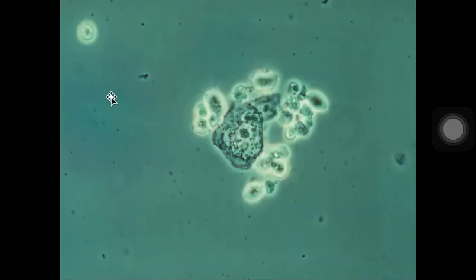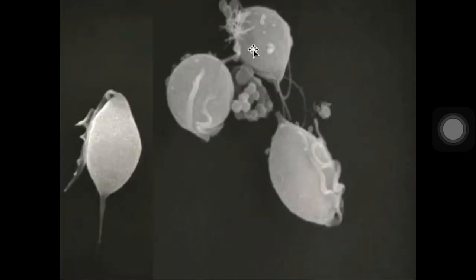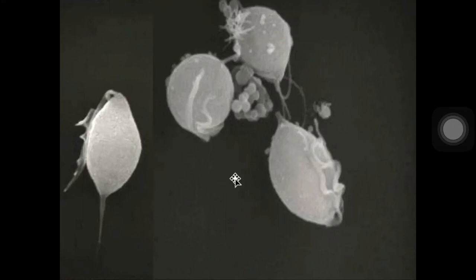And then this one is a phase contrast micrograph of a vaginal discharge, revealing the presence of Trichomonas vaginalis protozoans surrounding, this is an epithelial cell. Around the epithelial cell are the Trichomonas vaginalis. As you can see, they have flagella present there. And as you can see here more clearly, the undulating membrane and the flagella present. Next, using scanning electron microscopy, this is the presentation of strawberry cervix.